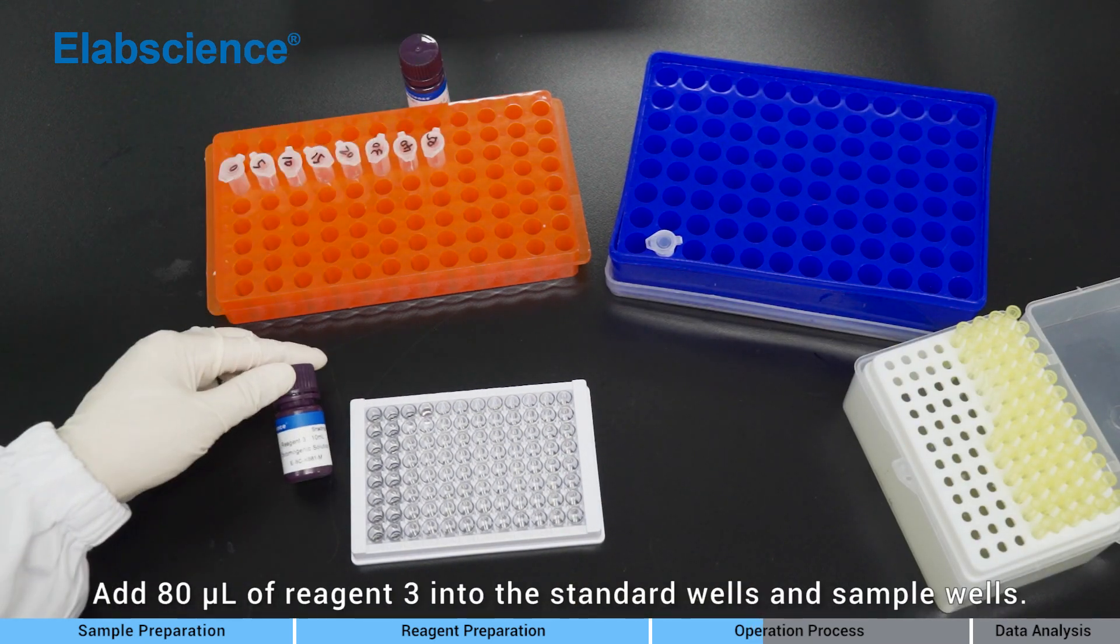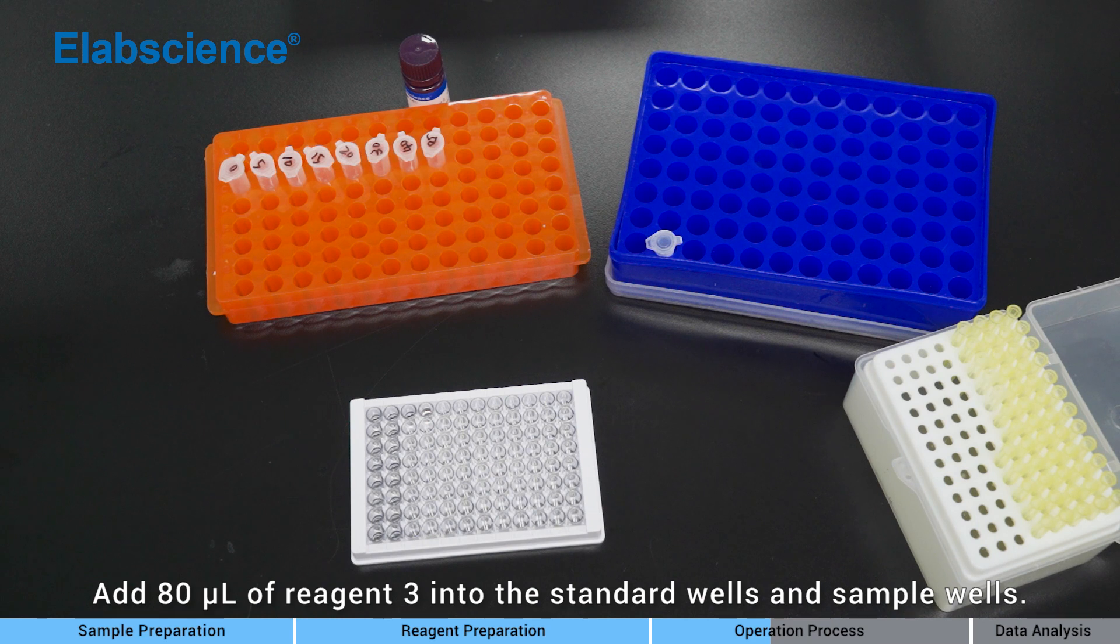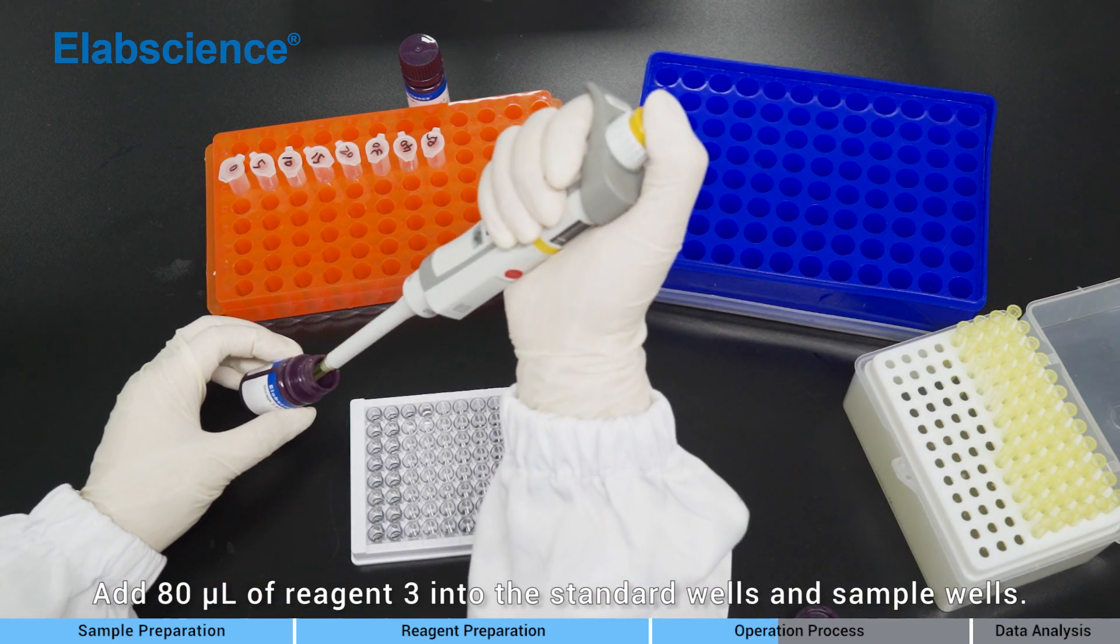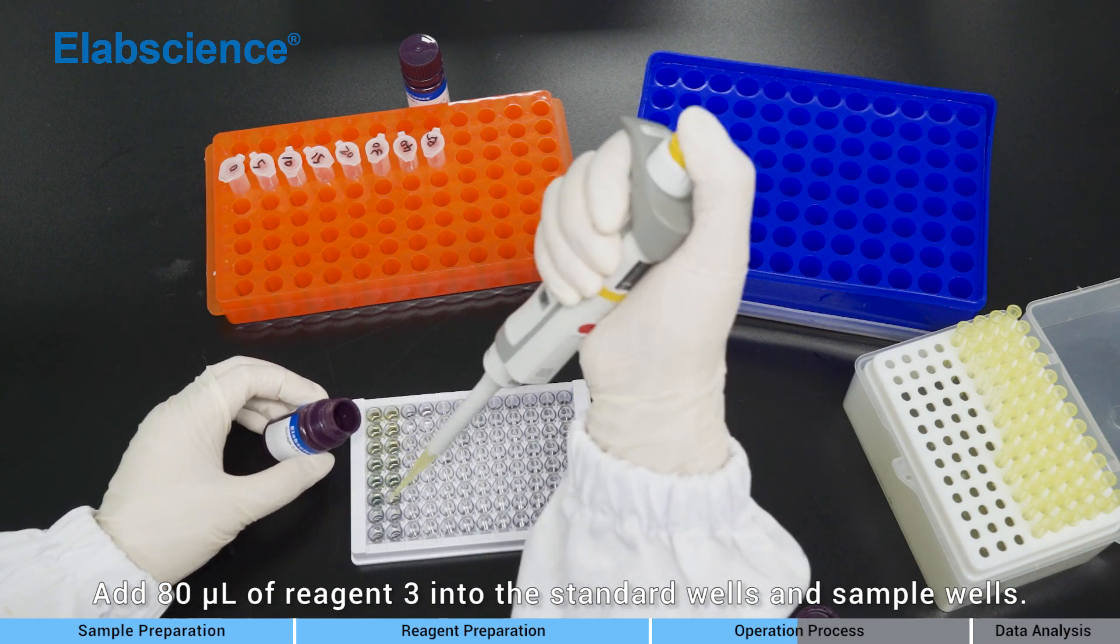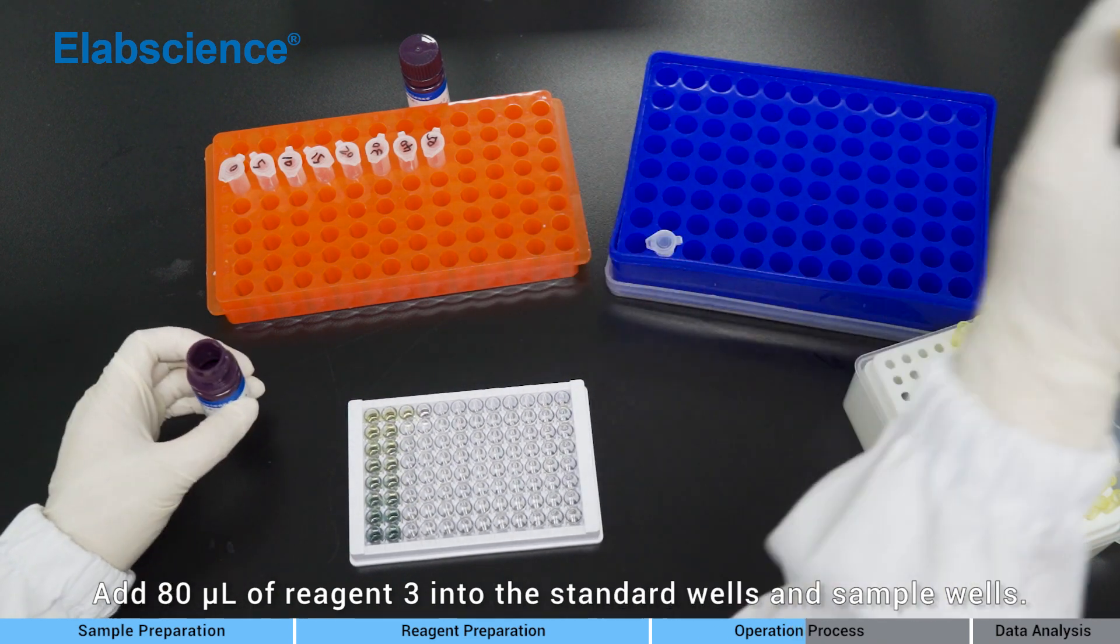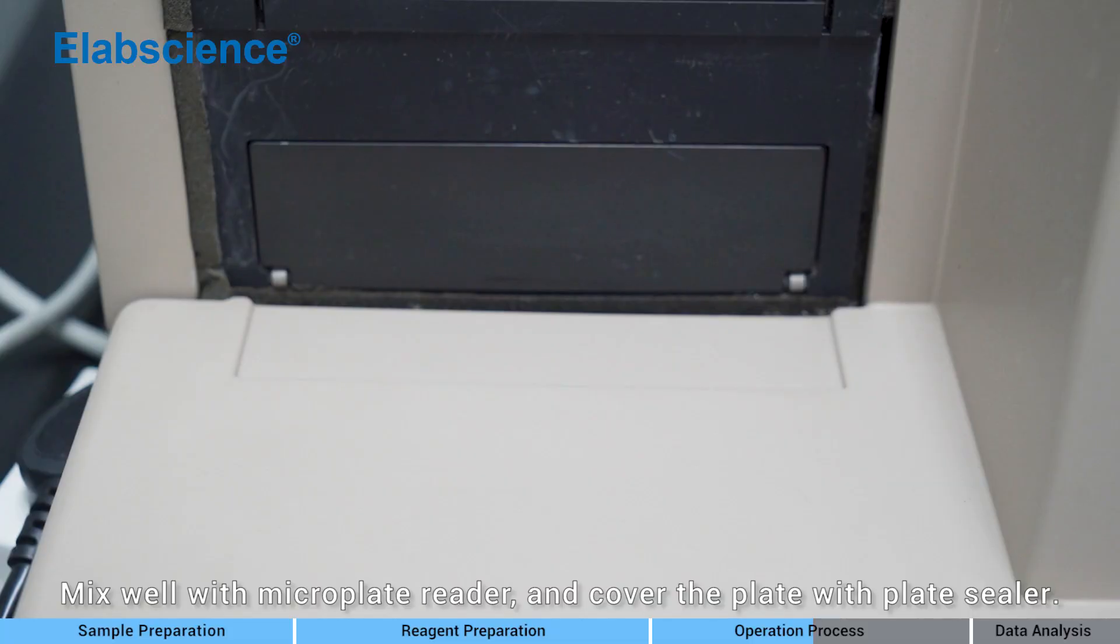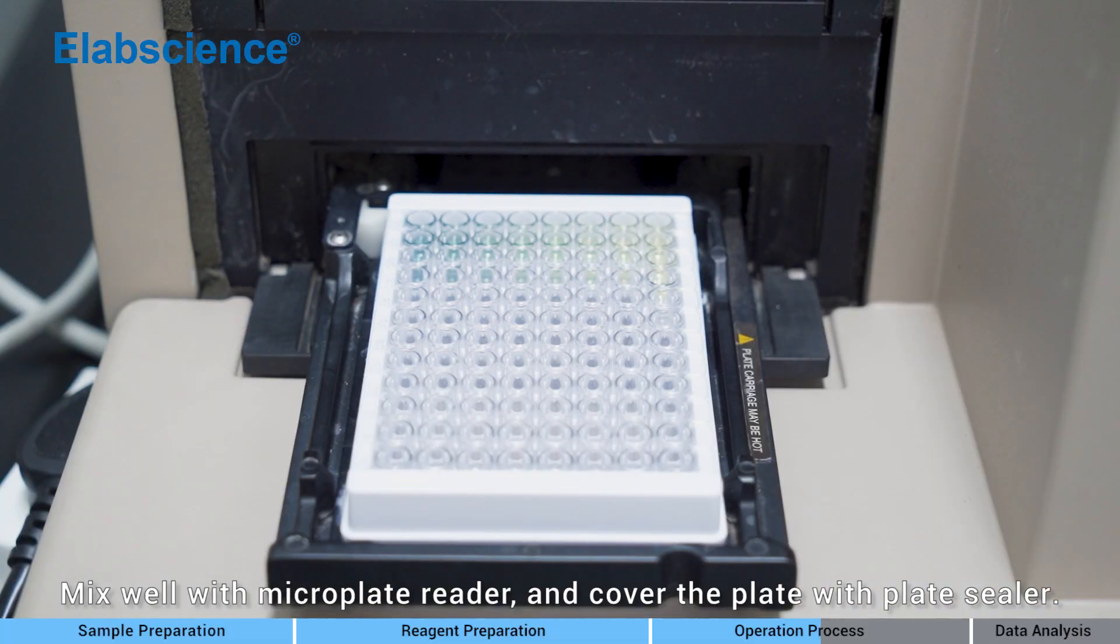Add 80 microliters of reagent 3 into the standard wells and sample wells. Mix well with microplate reader and cover the plate with plate sealer.